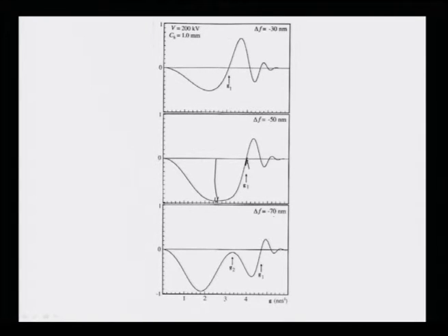But once we go to very high defocus values, we can see two spikes coming into the picture, one at g1, the other at g2, and both of them are not meeting the line at 0. So, that makes life very complicated.